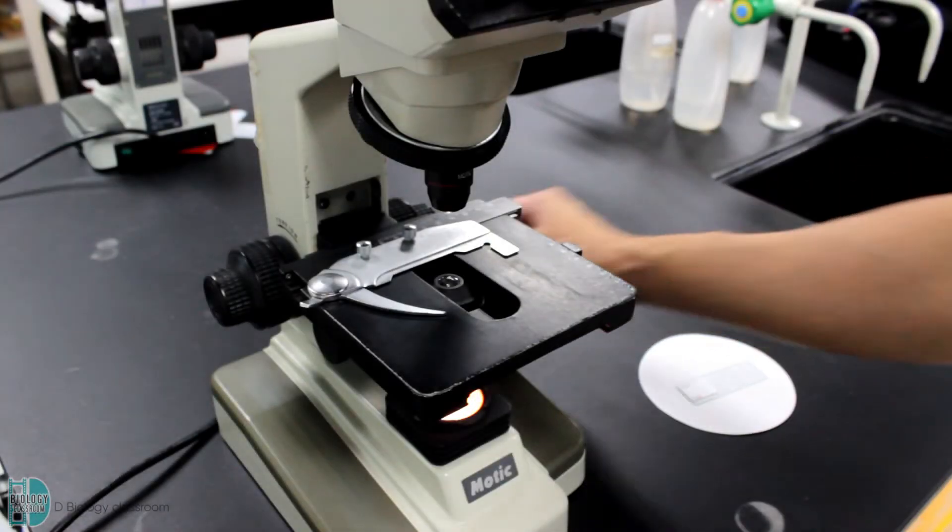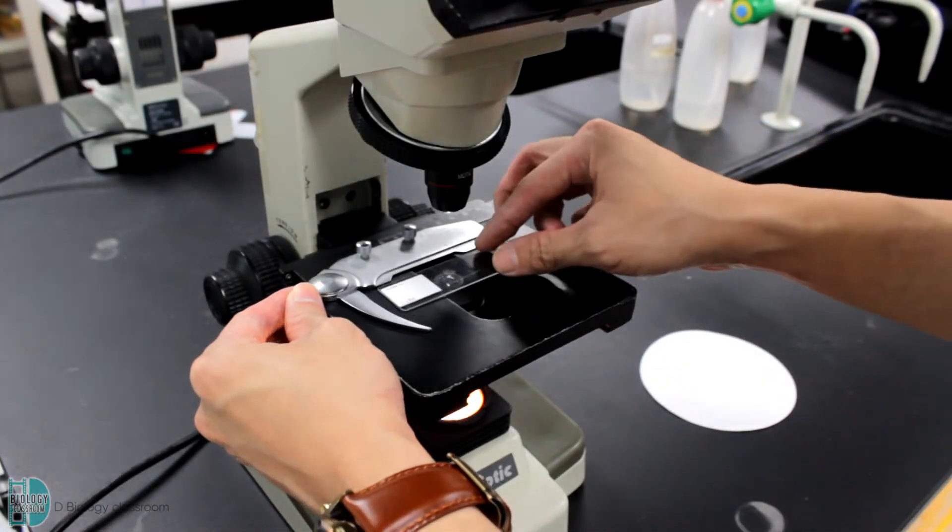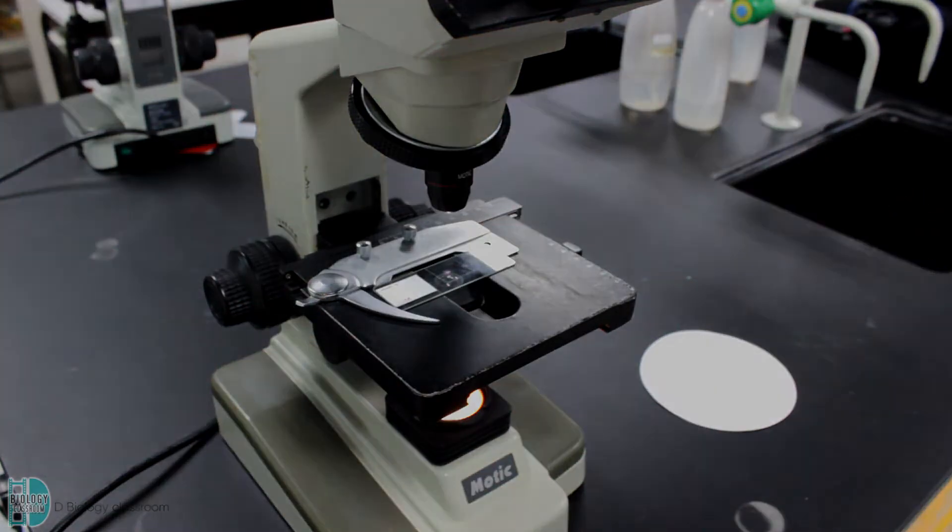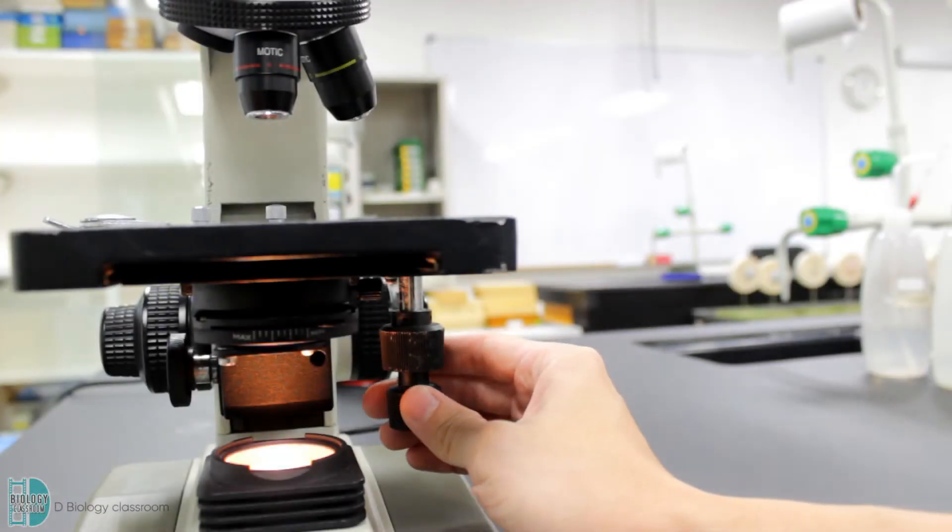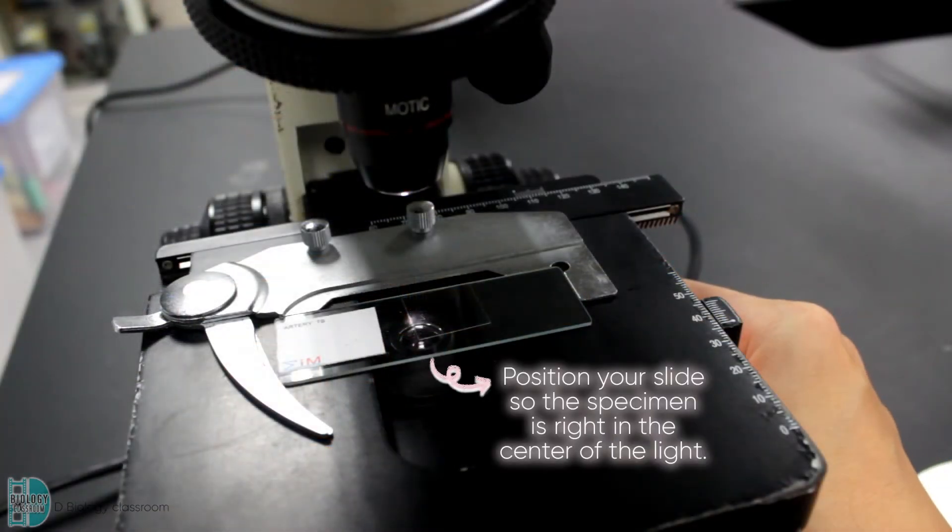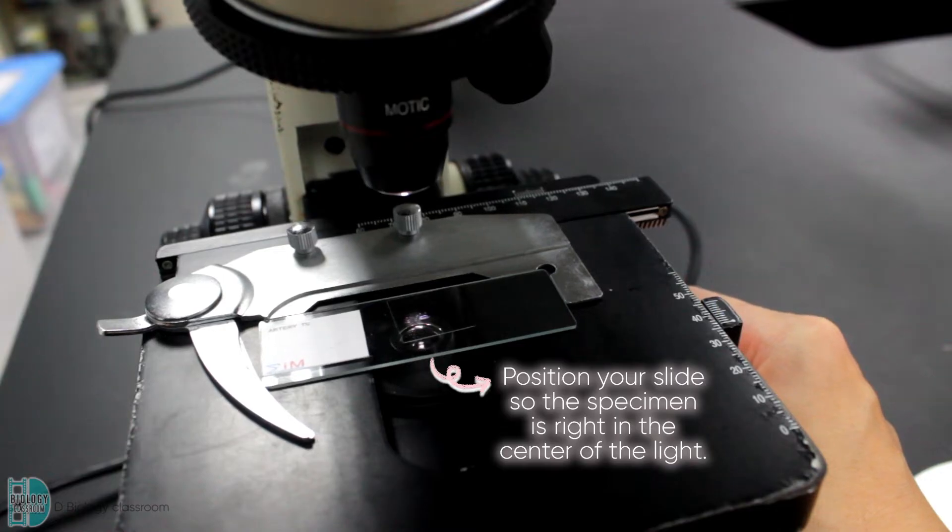Now, you can switch on the light source. Place the slide on the stage and use the stage clip to hold it in place. Use the stage controls to adjust the position of the slide. Make sure the specimen is right in the center of the light source.